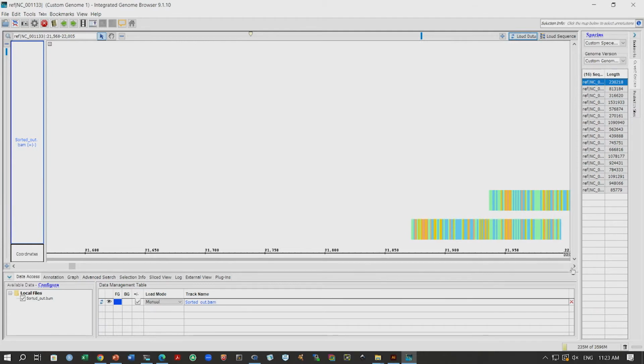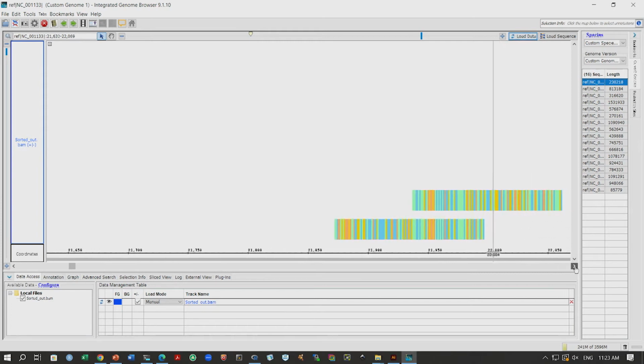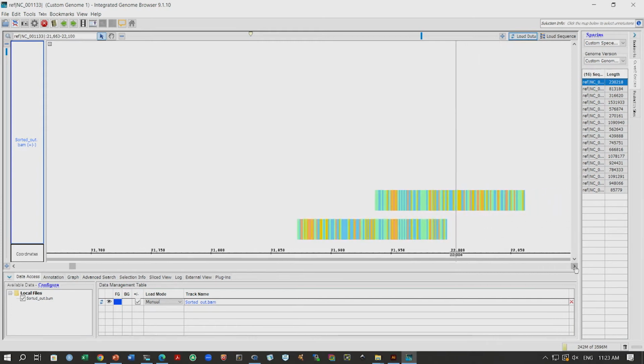And you might be wondering why this is so sparse. For some regions there is no read mapping at all. You can see this for some regions. Here is one region where you see these two reads, but on the left side there is no read mapping. Remember, we are working with that small data set, where we only took about 25,000 paired end reads. So this is kind of expected; 25,000 reads will not be able to cover most of these positions. Okay. All right.